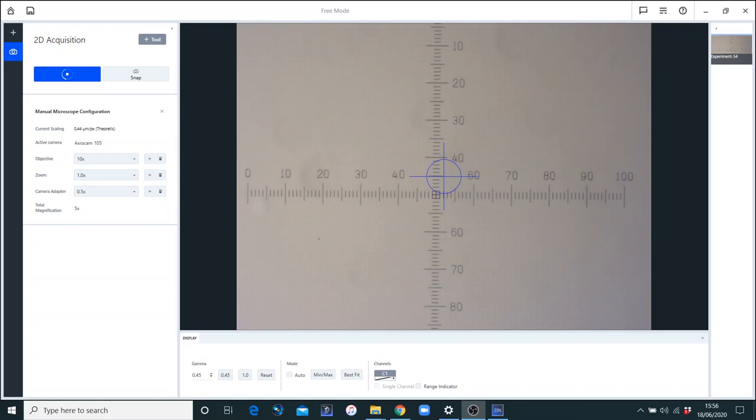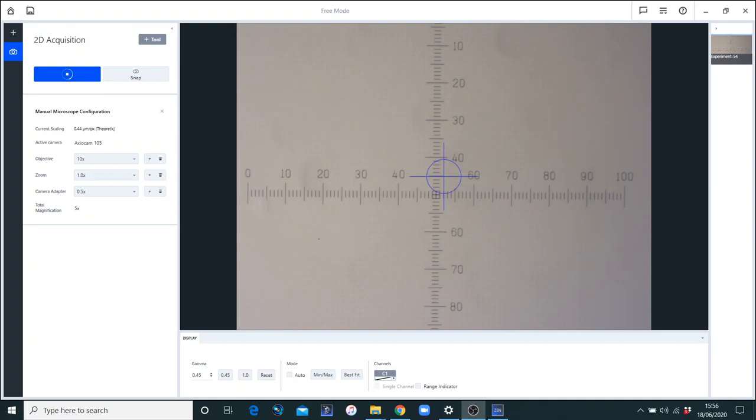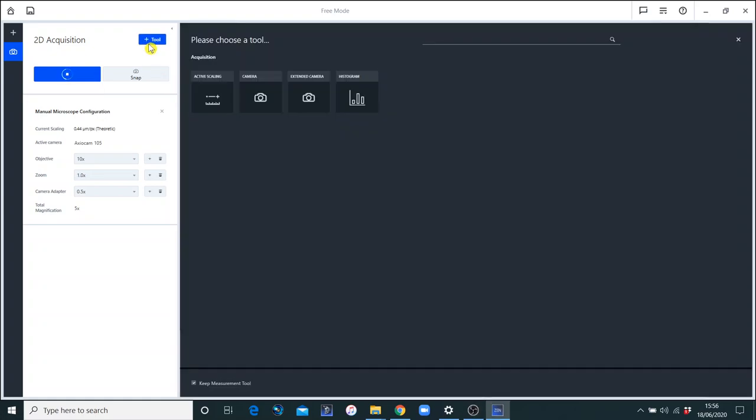Now I've got the microscope set to a 10 times objective, and you'll notice over here that I've got a workbench open, which is the 2D acquisition workbench. This gives me the manual microscope configuration menu. I'm assuming that you have some familiarity with Zen and this concept of workbenches. We've got some workbenches going on here, and I'm just going to add another tool.